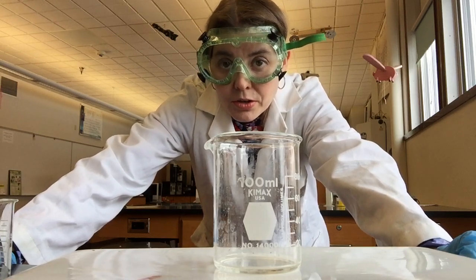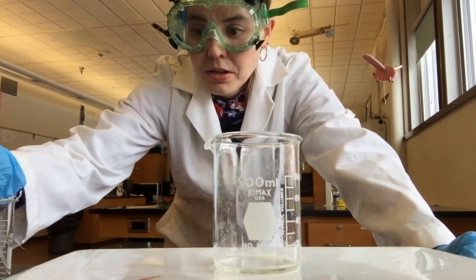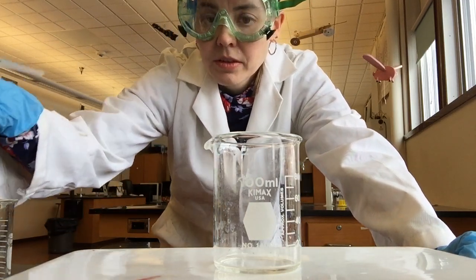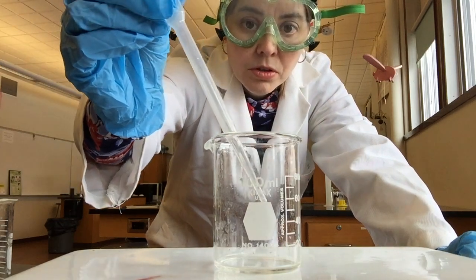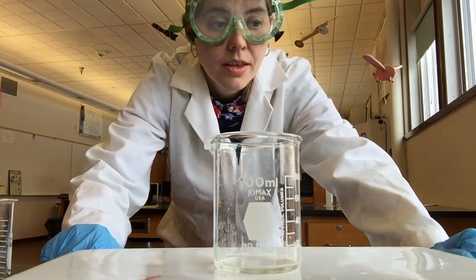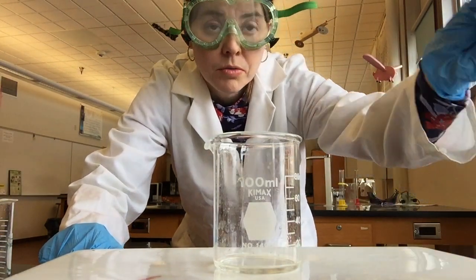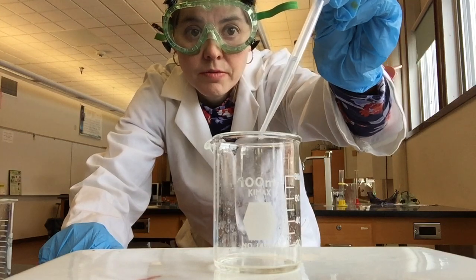Safety is always a priority, so I don't want to use very much. First I will add a small amount of sulfuric acid, and then I will add a small amount of sodium hydroxide.